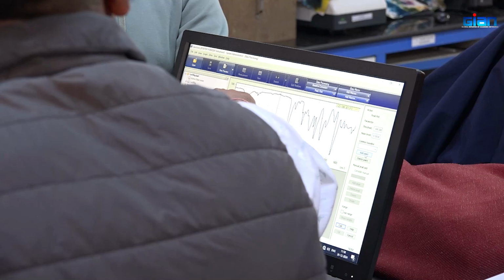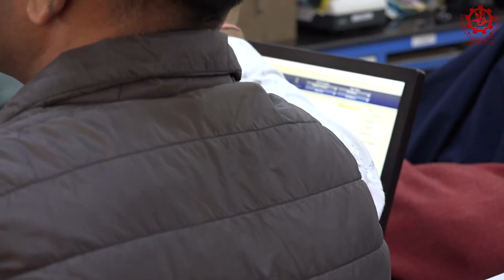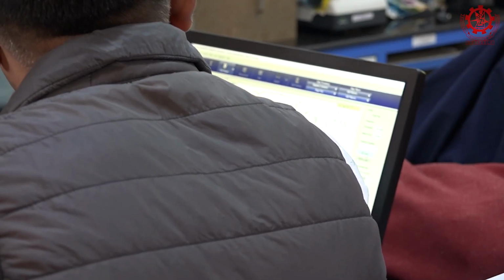Now you see here the percentage transmittance, T. When it is at the top, nothing is absorbed, everything is passed, right. Around here, let us say 3300, you see the transmittance is low. Can you see?